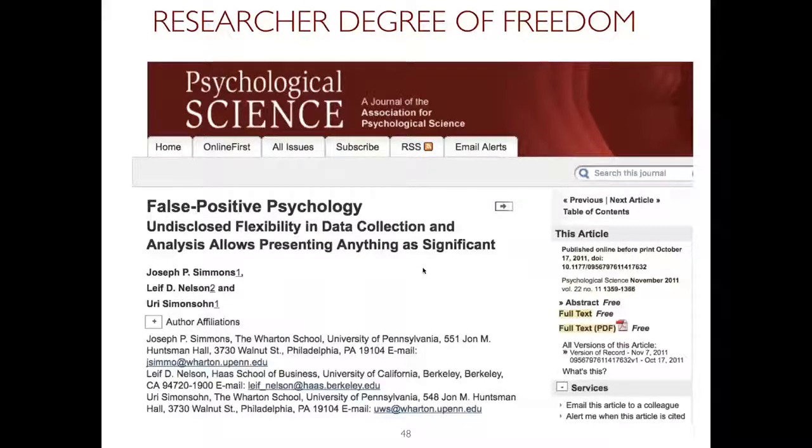Because if we start adapting our ways to filter things or ways to process things and have different parameters to get the small p-value, we will get the small p-value, but it will not be reproducible. And so this is a really important part. To me, this exercise really demonstrates how important it is to spell out upfront how exactly the data will be processed. This includes quantifying, identifying peaks, filtering, and so on. So this is an important part.